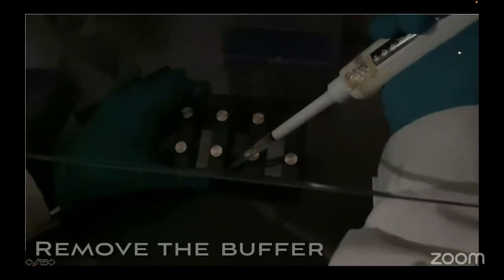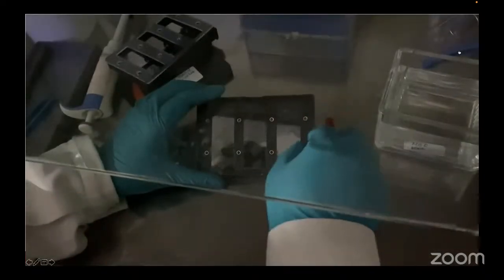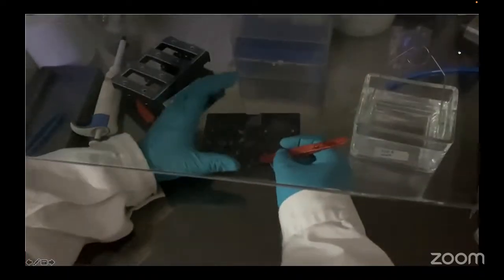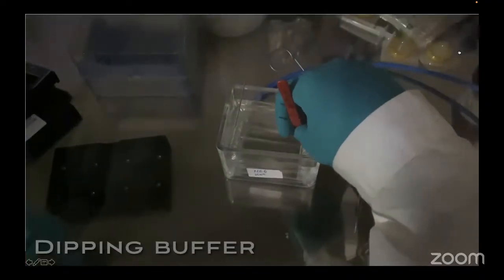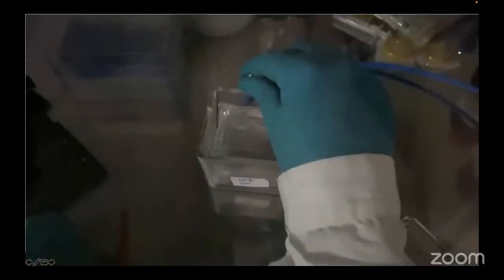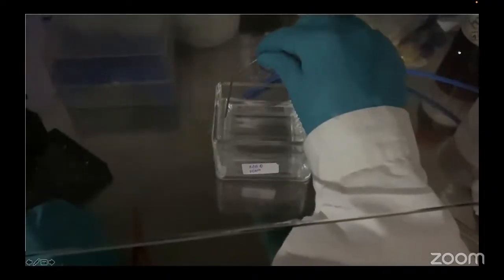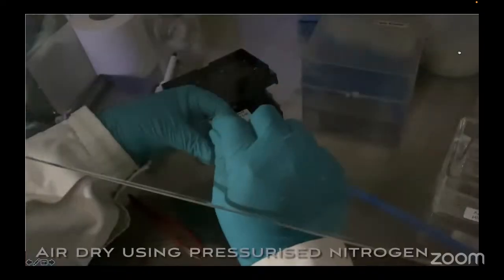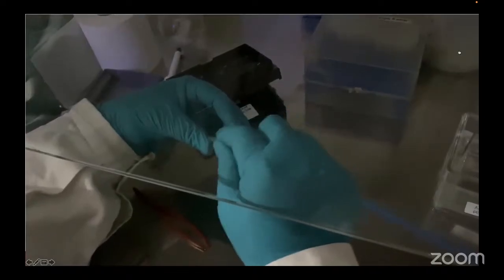Now remove the buffer and wash the slide thrice using washing buffer. Now gently take out the slide and put it in dipping buffer. This is done to wash away all the salts that may be over the peptide chip. Use a pressurized stream of nitrogen to completely dry the slides.